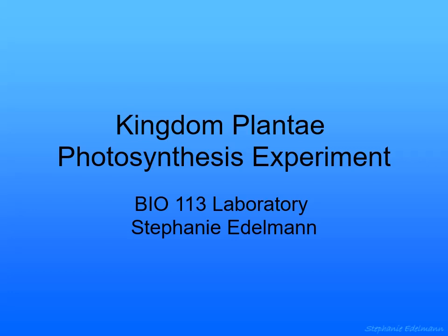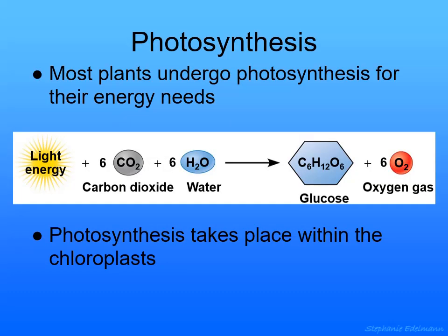So let's talk about the photosynthesis experiment for a moment. Most plants undergo photosynthesis for their energy needs. Photosynthesis takes place within the chloroplast. The way photosynthesis works is plants take light, carbon dioxide, and water, and they transform that into glucose and oxygen gas.